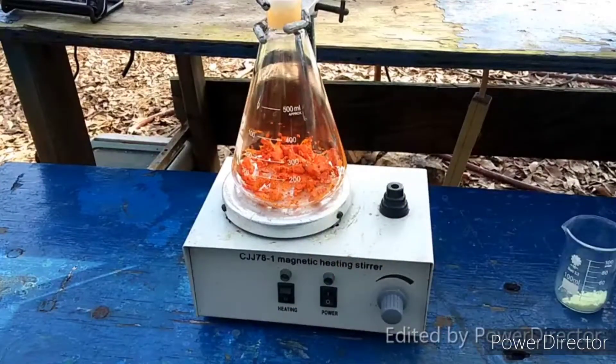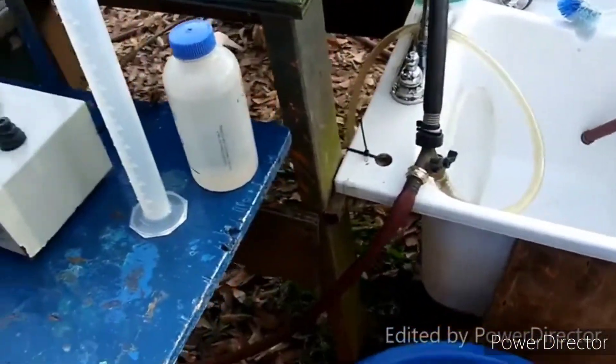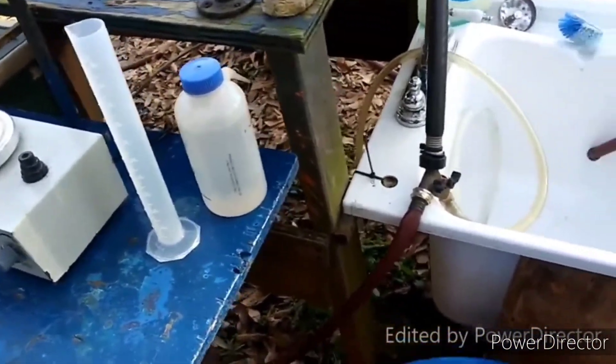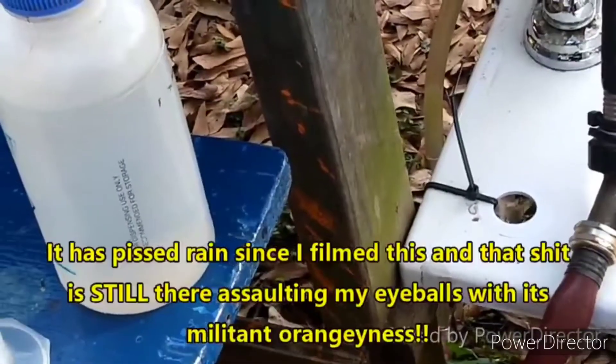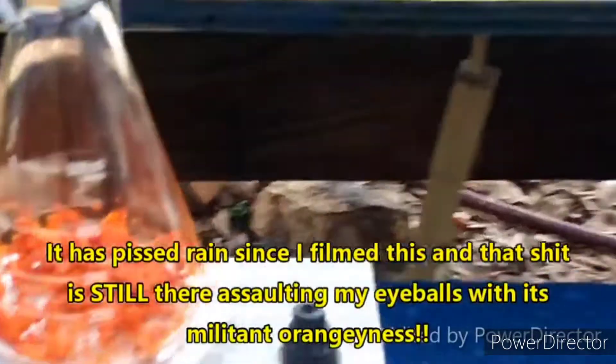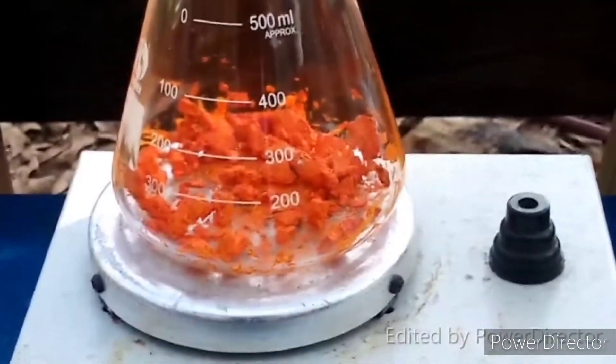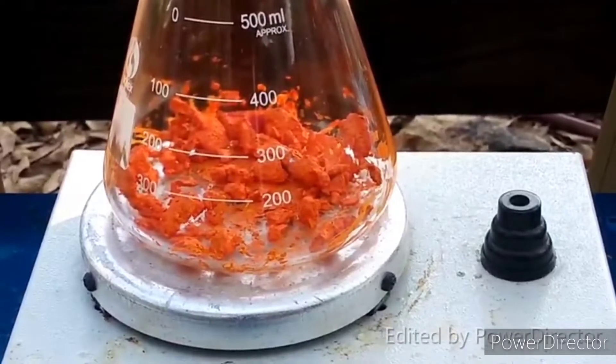It is un-fucking-real. I had a slight spill of it yesterday, and you can see that shit is still there. I have washed that with a hose and done everything short of scrubbing it down with a scrub brush. So yeah, if you're looking at making your own pigments at home, this is probably a good choice for orange.